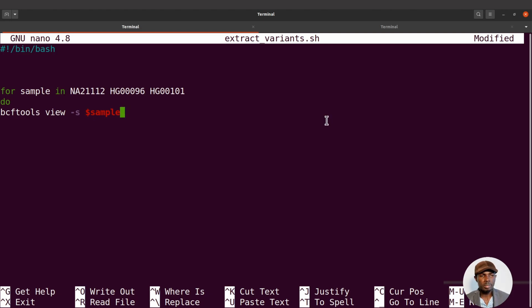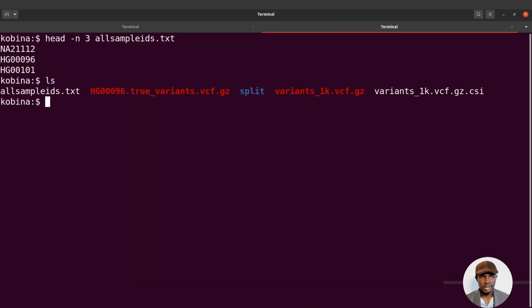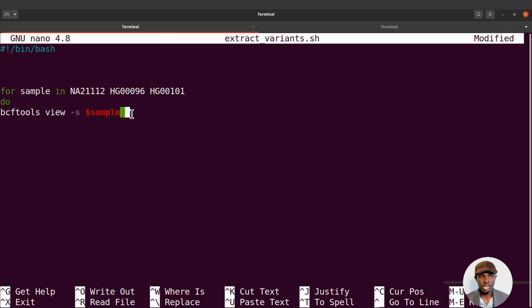And then I'll bring the main VCF file, the one which has the information, which is this one here. Let's do an ls, this one here. All right, I'll need it. So I'll just specify that that's what I need. And then when you come here, this is where I bring the -c1.